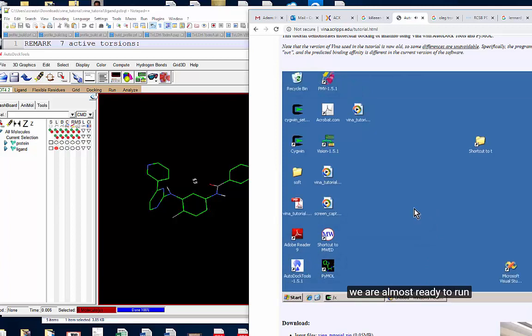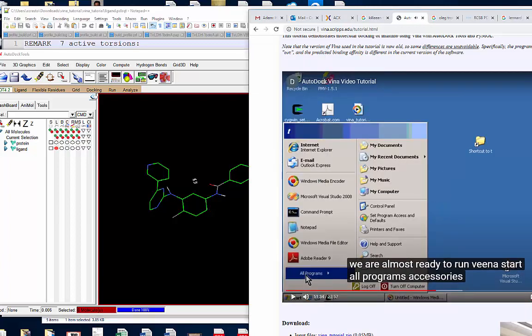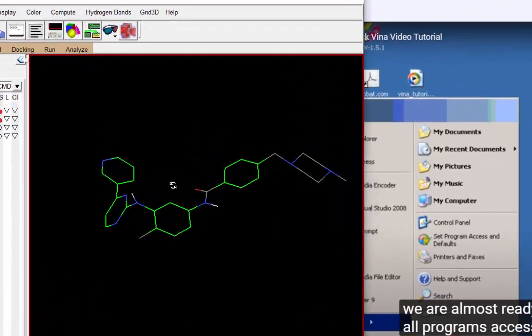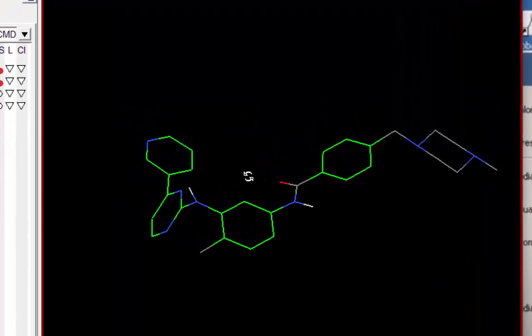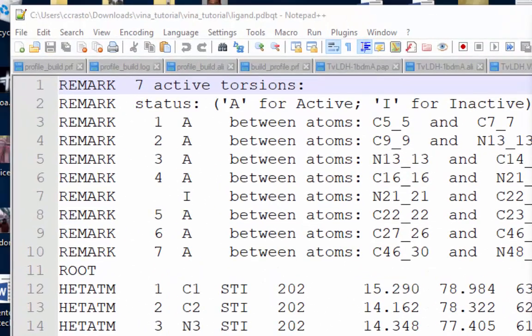We're almost ready to run Vina. Okay. Start. Let's close. Okay. And it's gone. All right, we're almost ready to run Vina. So let's see what he's going to do.